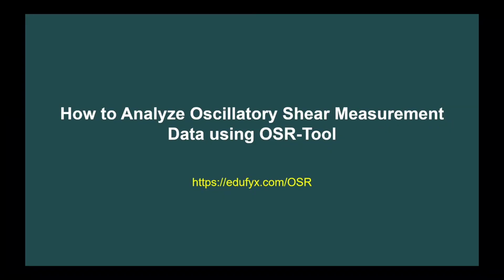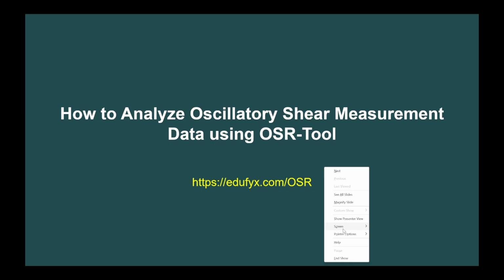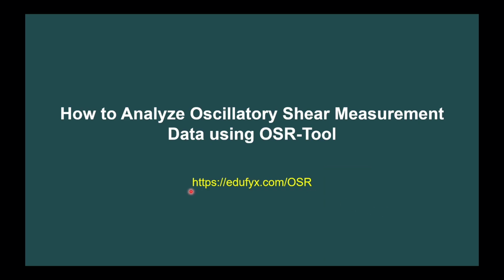Hello, in this video I want to show you how to analyze oscillatory shear measurement data using OSR-Tool. You can access OSR-Tool at this URL. I want to introduce oscillatory shear briefly.